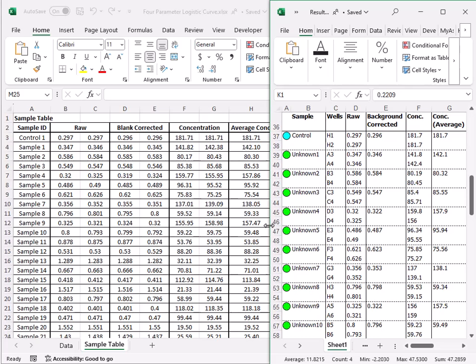When comparing fit results from different implementations, it's important to note that all nonlinear fitting models inherently involve some degree of error, which can lead to minor differences in outcomes. A key metric for assessing how well the model fits the data is the R-squared value, where values closer to 1 indicate a better fit. Thus, when comparing fits, it's helpful to examine the R-squared value. In this case, both implementations produce high and consistent R-squared values, indicating a good fit in both instances.